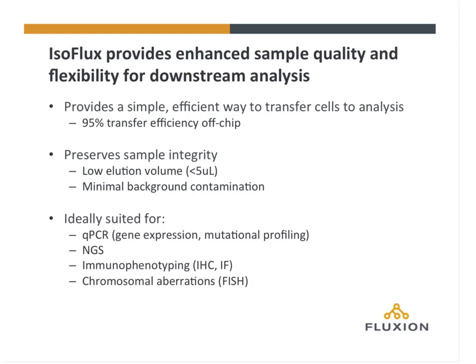Additionally, the CTCs that are recovered are suspended in a droplet that's got only about 5 microliters of volume. And this means that the entire sample, by the time it's collected and recovered into a collection tube, can be as little as 10 to 20 microliters. And this is really critical for doing the downstream work because many of the molecular applications that are commonly used with CTCs have limited volumetric inputs.